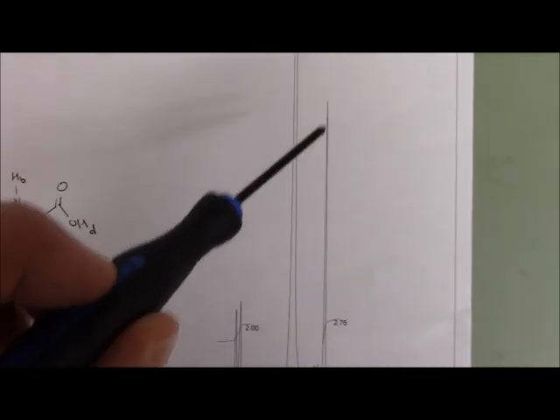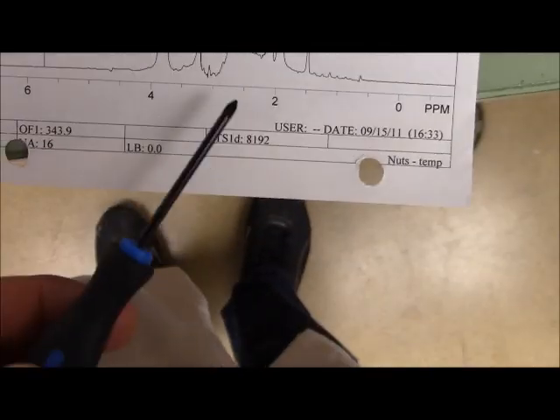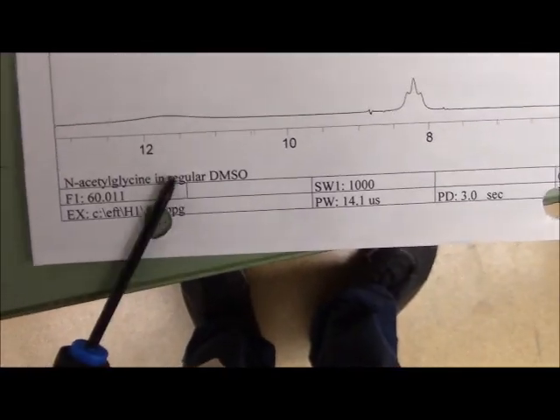Hydrogens at A is a singlet. This one right here. And that's at 1.96. We're very close to it. This giant peak for me is water. Now mine happens to be at 2.2, right? Or that's actually, sorry, folks, no. That for me, I ran mine in regular DMSO.